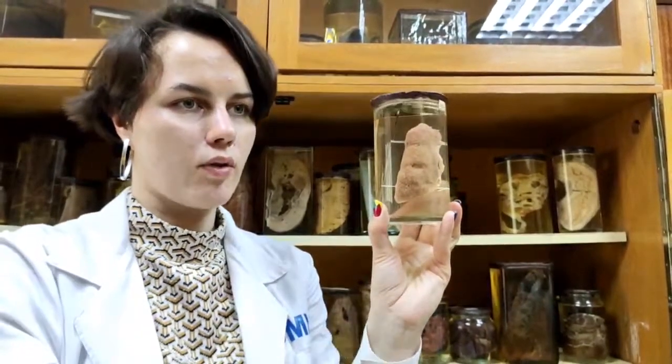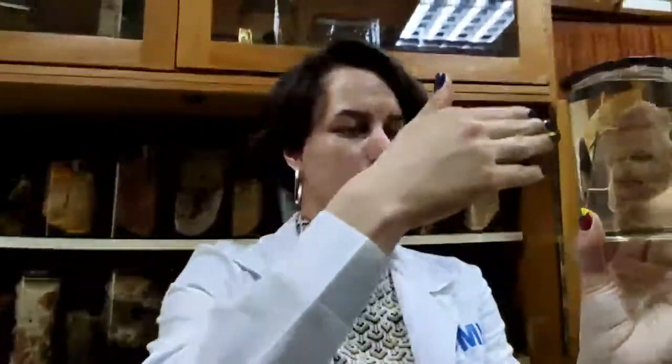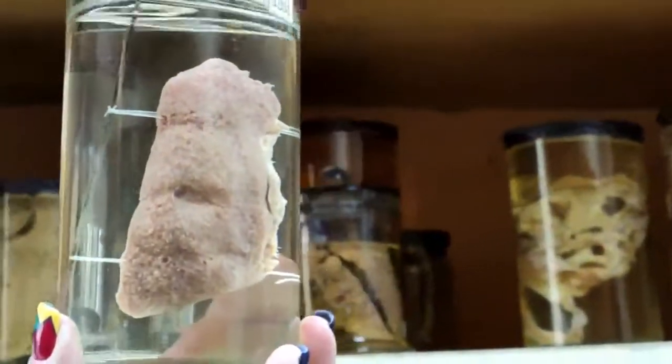nephrons, it's very serious, because in hyalinosis of the small blood vessels, some glomeruli are atrophied, and some remaining glomeruli undergo hypertrophy. And we see a contrast between atrophied glomeruli and glomeruli which are enlarged because they undergo compensatory hypertrophy. This is why we can see that the surface of the kidney is granular, because somewhere we have nephrons, somewhere we have loss of nephrons.